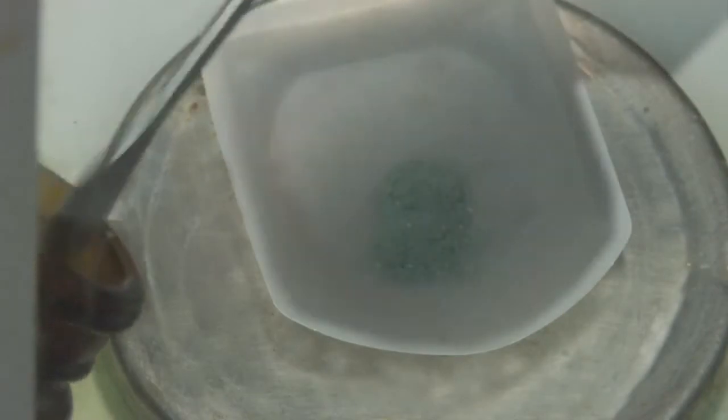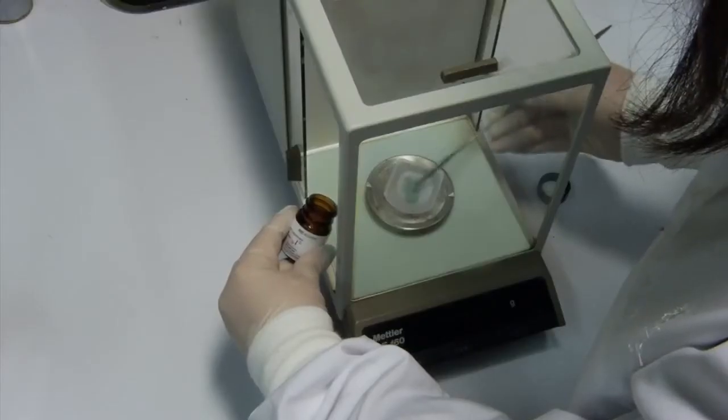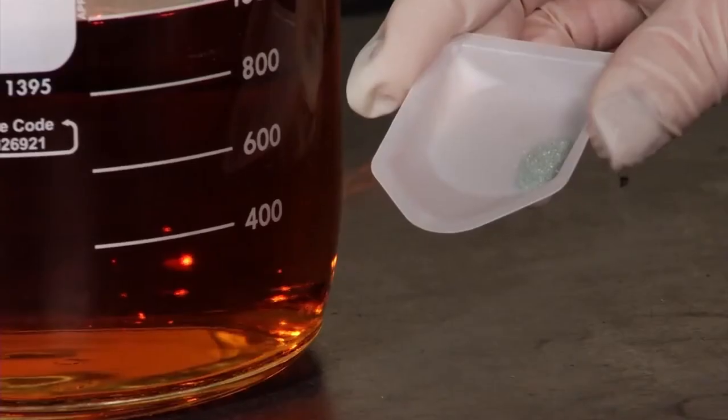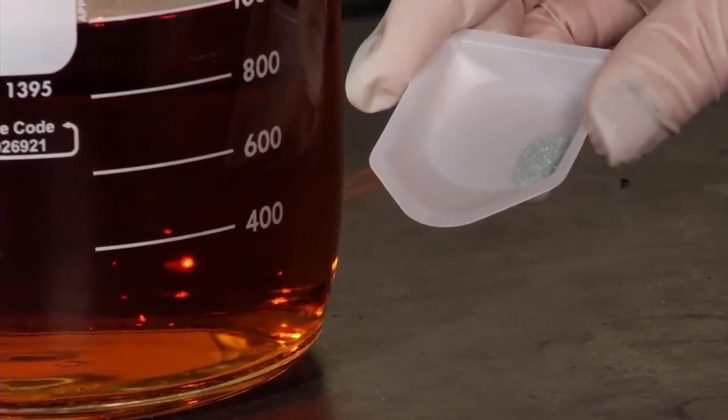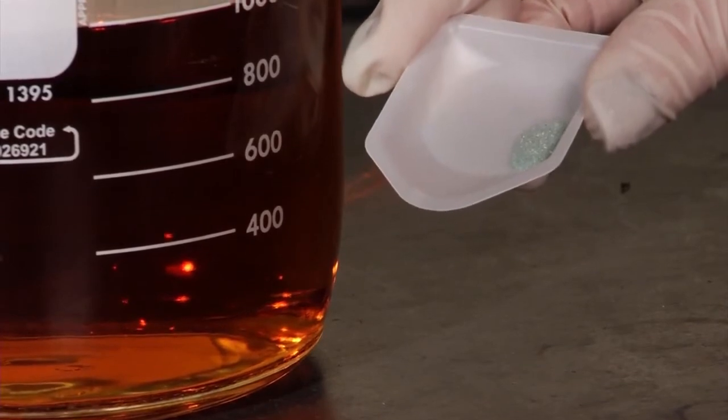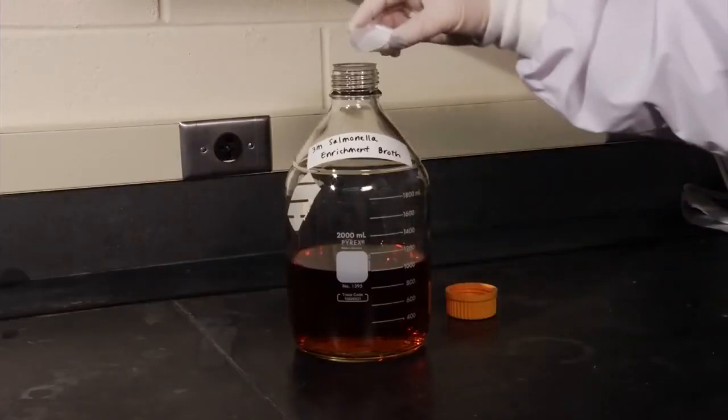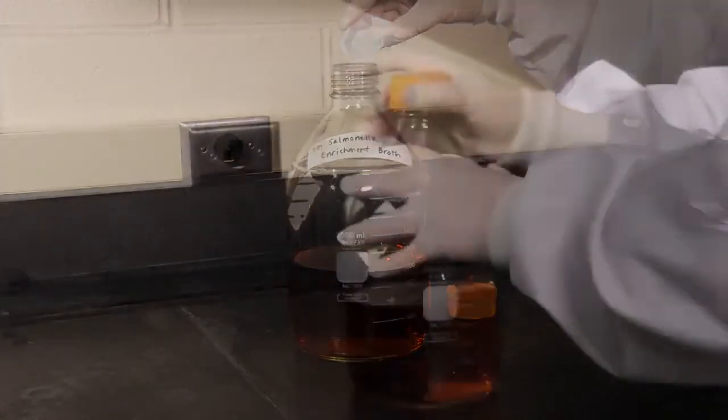To prepare the 3M Salmonella Enrichment Supplement, weigh 50 milligrams plus or minus 2.5 milligrams of the supplement using an analytical balance. Temper the sterilized base to 20 to 42.5 degrees Celsius, then add 50 milligrams of supplement. Shake the base supplement container vigorously to effectively dissolve and mix the supplement with the base solution.